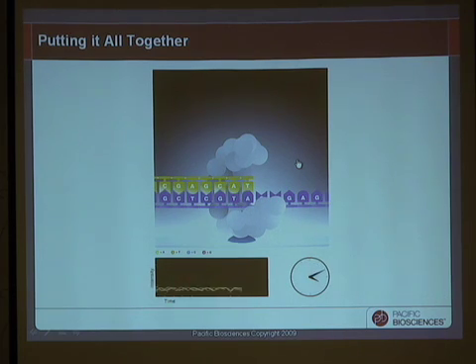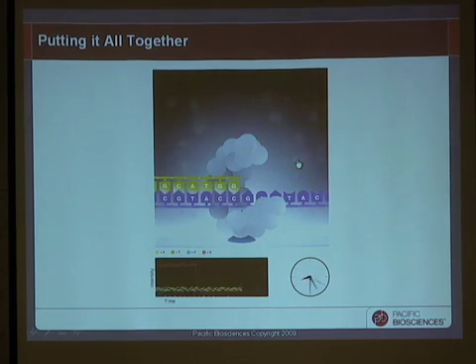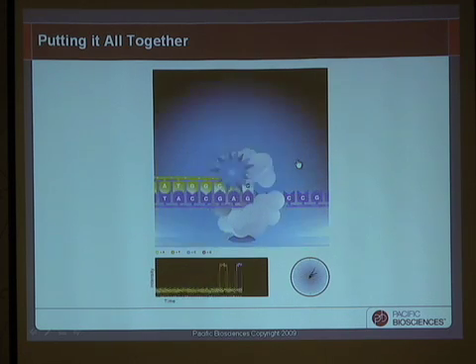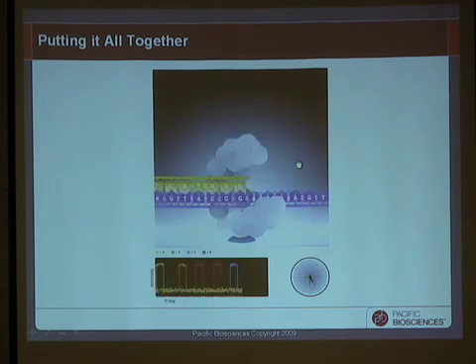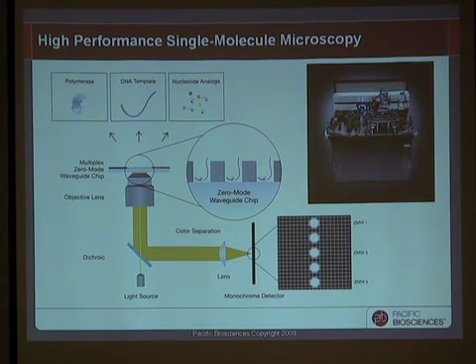The enzyme will translocate to the next position spontaneously, and the whole process can repeat. There's binding, there's detection, translocation, binding again, and this process repeats ad infinitum. After the event is complete, it returns the system back to precisely the same state that it was in before the binding event, which you'll see later is very important. In real time, it looks like this, where there are several bases incorporated per second by that one polymerase. And this is the way that we implemented single molecule real-time DNA sequencing. I want to show you just a little bit about the instrument that we use for the analysis, because it will help with understanding the data that I'll show you later.